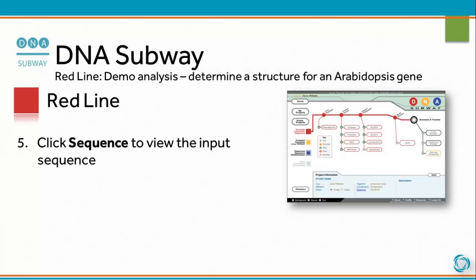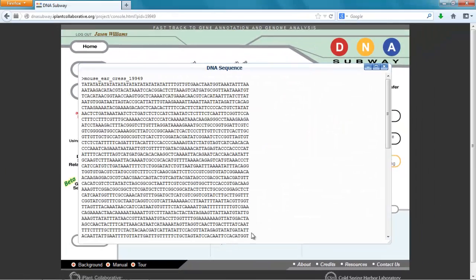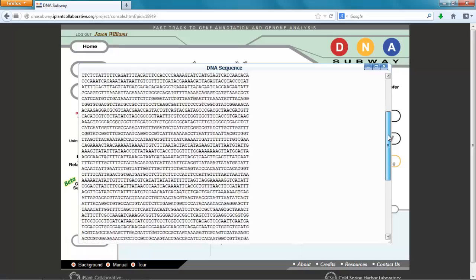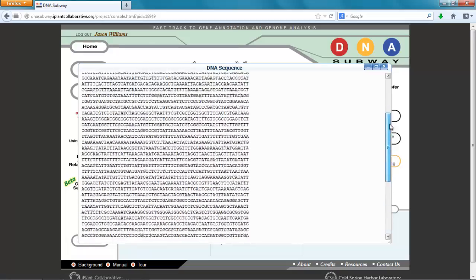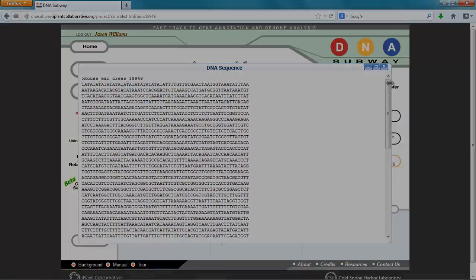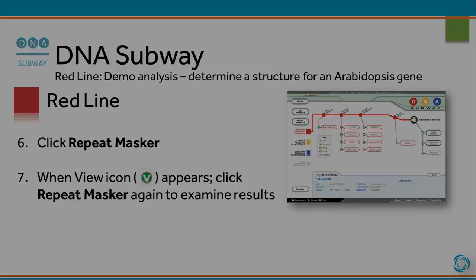Click Sequence to view the input sequence. Click Repeat Masker. When the view icon appears, click Repeat Masker again to examine the results.